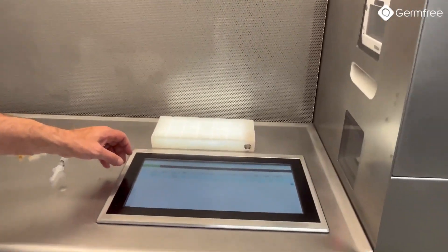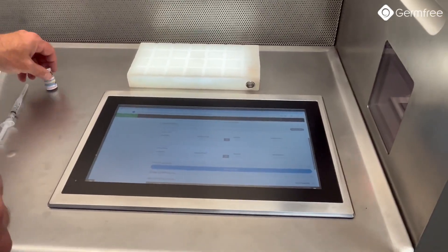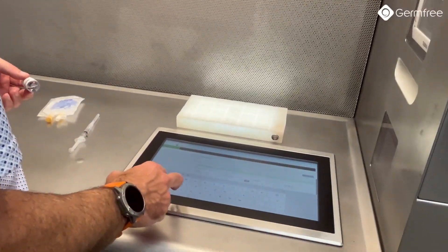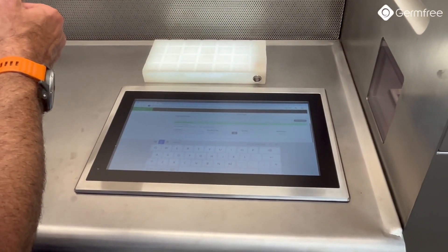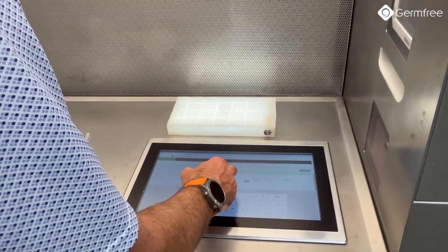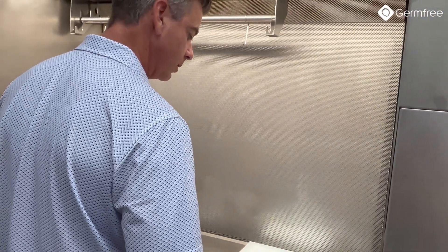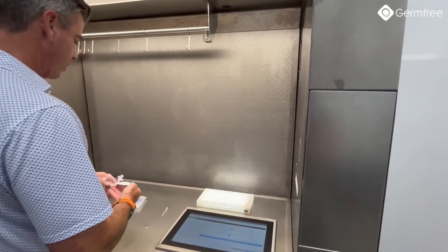Here I can come in and choose my preparation. I can use the built-in scanner to actually scan the vial. Then if I wanted to call out the lot number, I can actually use the voice command — 8122-1127-3-0. I can use that for lots, expirations, and any other documentation that I want to do.